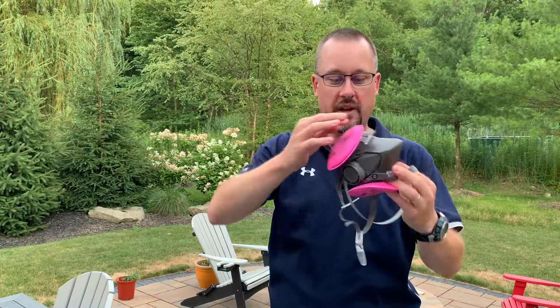To take it off, just undo, lift up, and you're good to go.